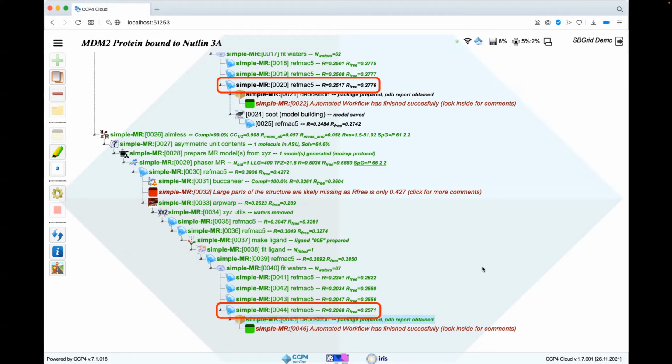Actually, it is a very interesting topic to see how structure can be brought to lowest possible R factors, but it is out of the scope of this webinar. But these questions are covered very exhaustively at CCP4 schools, and you are very welcome to check in one of those. So please just visit CCP4 website to learn when the next CCP4 workshop is coming.